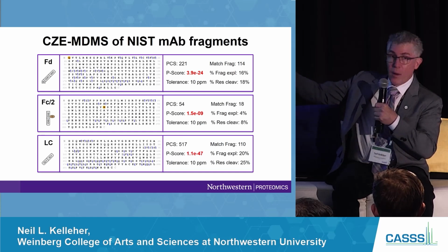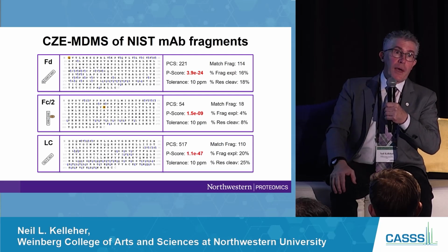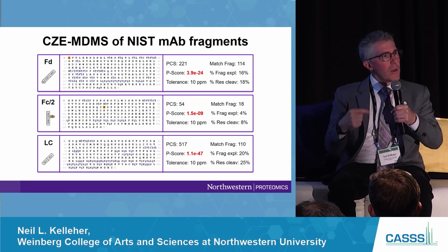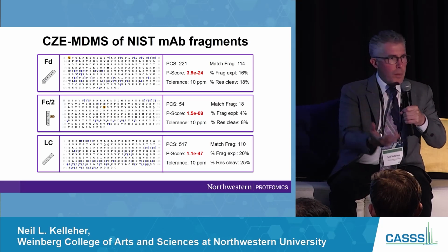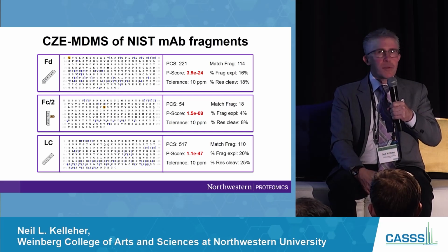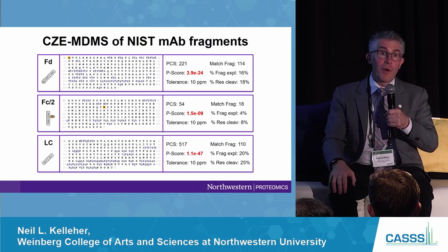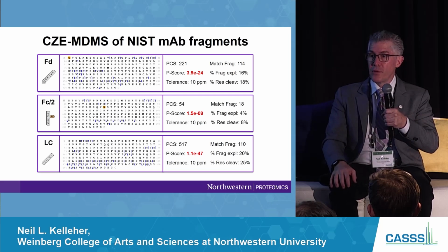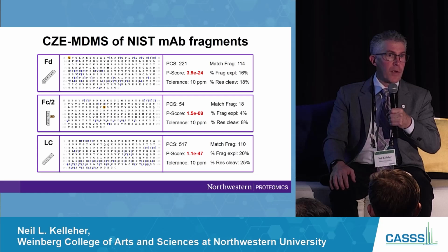You just need more ion current. And so it's more like 100 milliseconds. And so until we solve that, but if I'm a vendor, I'm creating instruments around the marketplace. The biopharma speaks with the largest voice for top down, middle down that there is. But you're not the top market. I think if you look at these instrument sales, the peptide bottom-up proteomics market is the dominant driver.